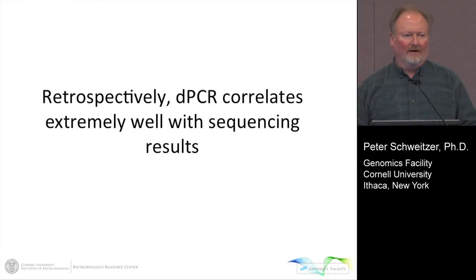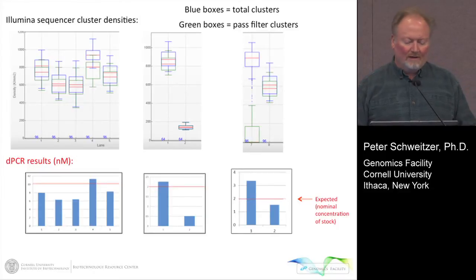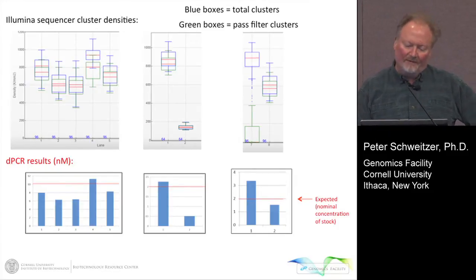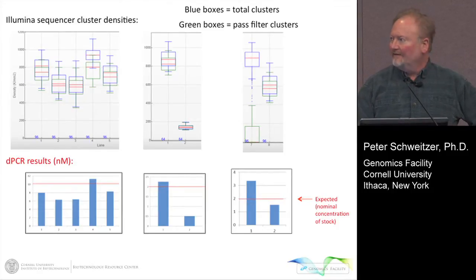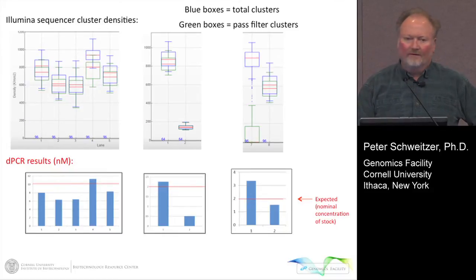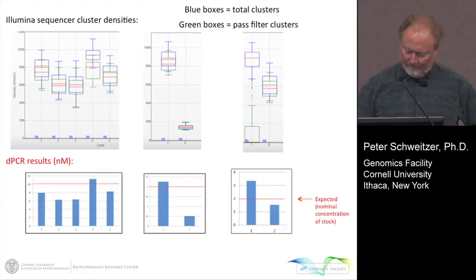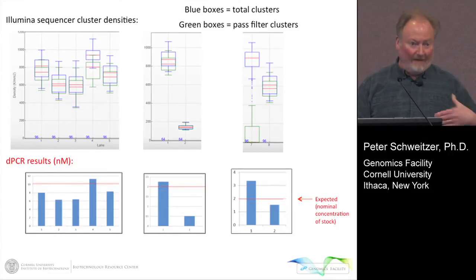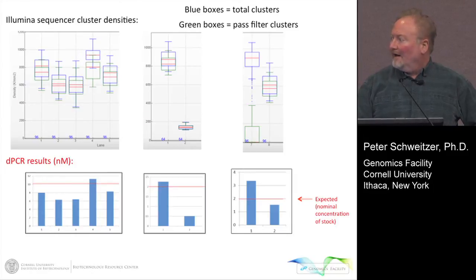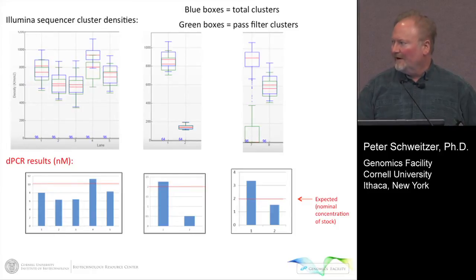We spent a lot of time retrospectively checking our libraries, convincing ourselves that this would work, and sure enough, the quantifications with digital PCR correlate extremely well with our results off the sequencers. The left panel — all five lanes are fine but some are a little bit lower, and the digital results correlate extremely well with those cluster densities on the flow cell. The red bars are what we thought each library was. The middle panel shows an under-clustered lane — testing with digital PCR after the run, that sample was quite a bit lower than we thought. Here's an example of one that was over-clustered, and sure enough it was quantified as higher than expected.